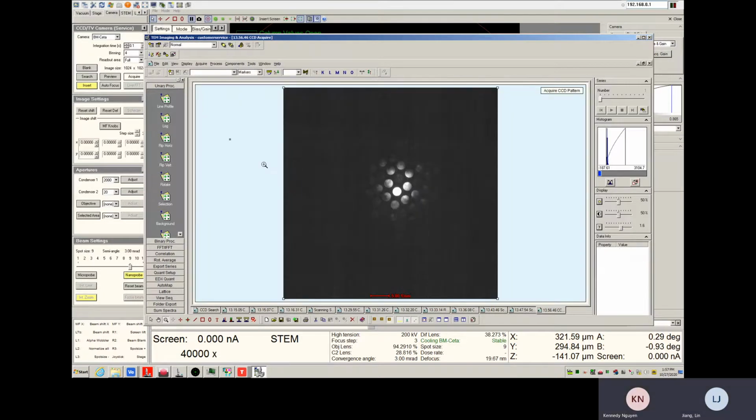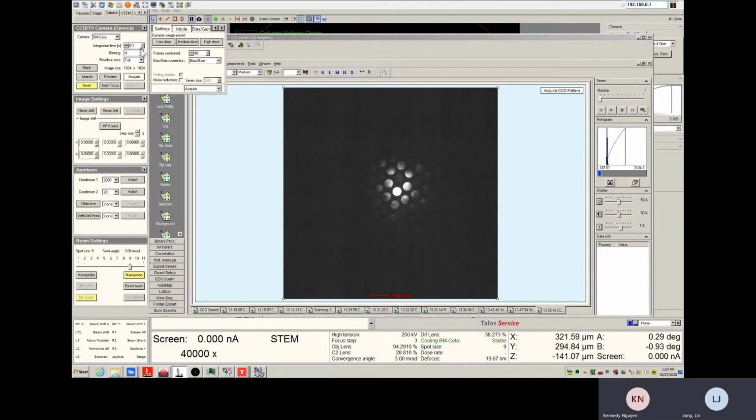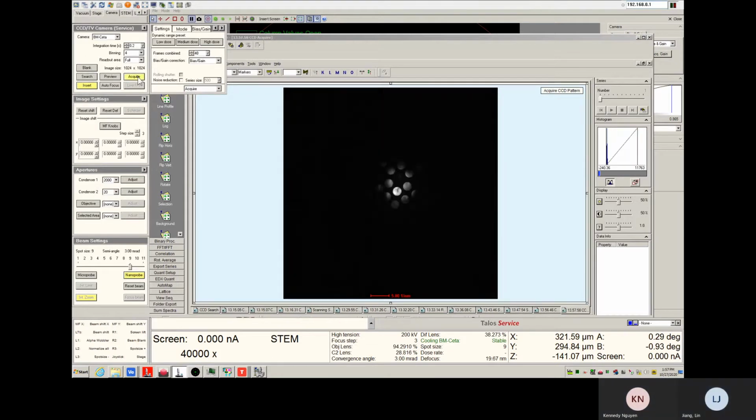Okay. Go to integration for the acquired prism, choose 0.2. But not 0.1, right? Go for 0.2. Also, still 40 frames. Enter. Yeah, that's good. And I acquire another image. Okay. Pretty good.